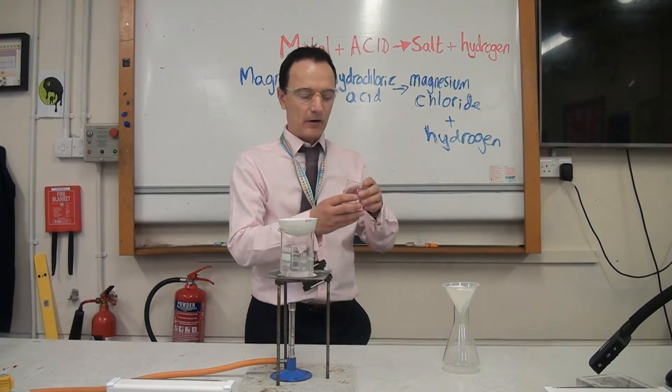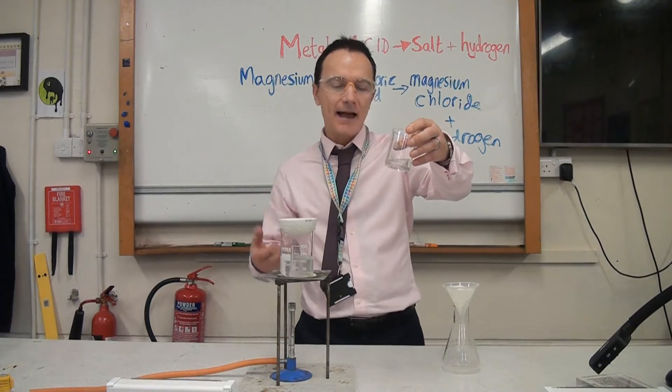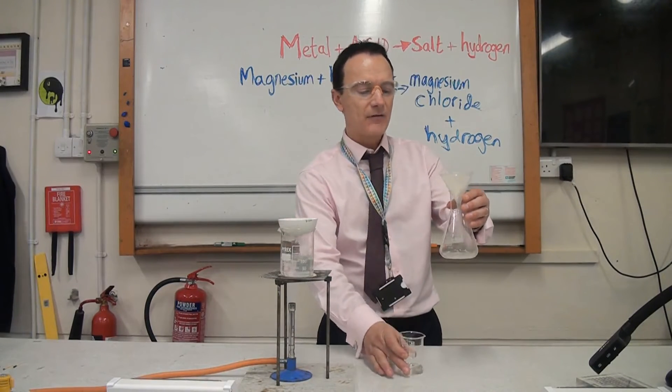So we've got here our magnesium chloride solution plus the excess magnesium. We need to take out all those pieces of magnesium, and we'll do that by filtering the solution. That will obviously take a few minutes to filter.